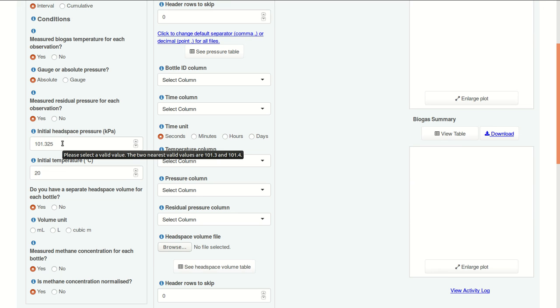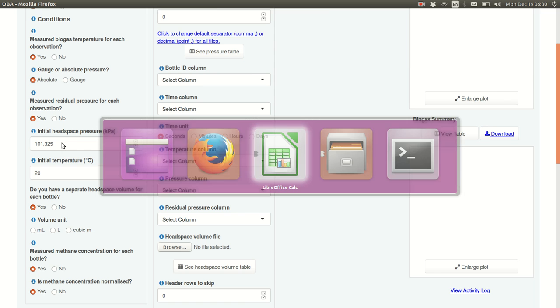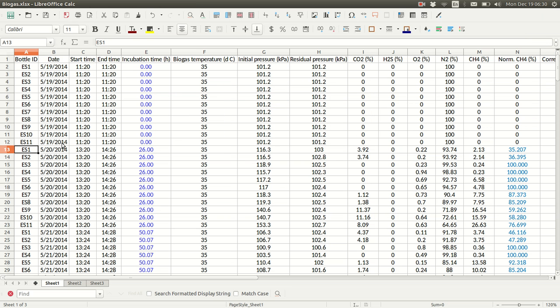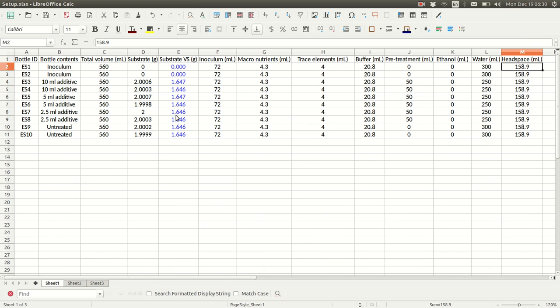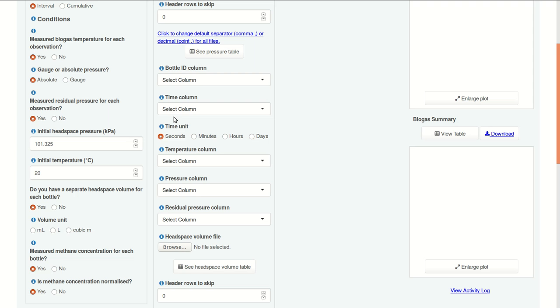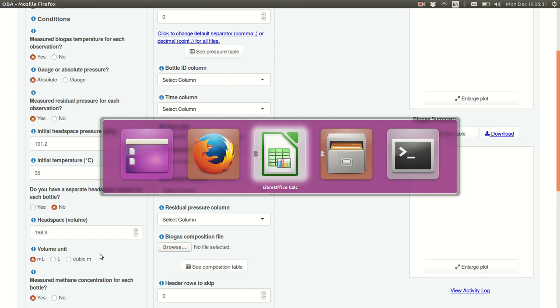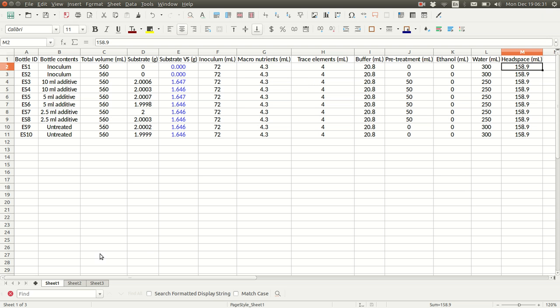Our initial headspace pressure. Let's check the data file. We actually have a measurement for this. 101.2 at a temperature of 35. 101.2 kilopascals at a temperature of 35. We do have a separate headspace volume for each bottle, but the values are all the same. 158.9 milliliters. Let's double check that. Yes.